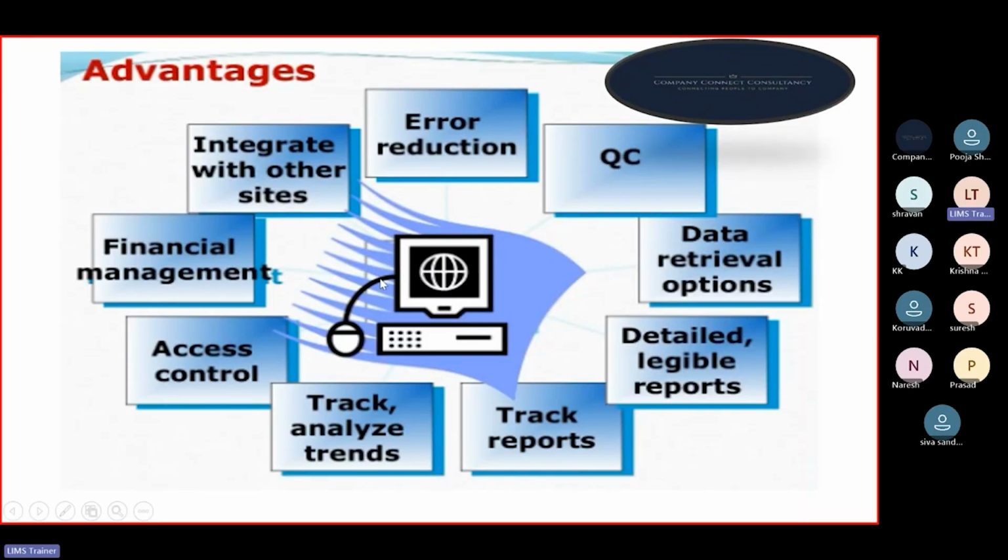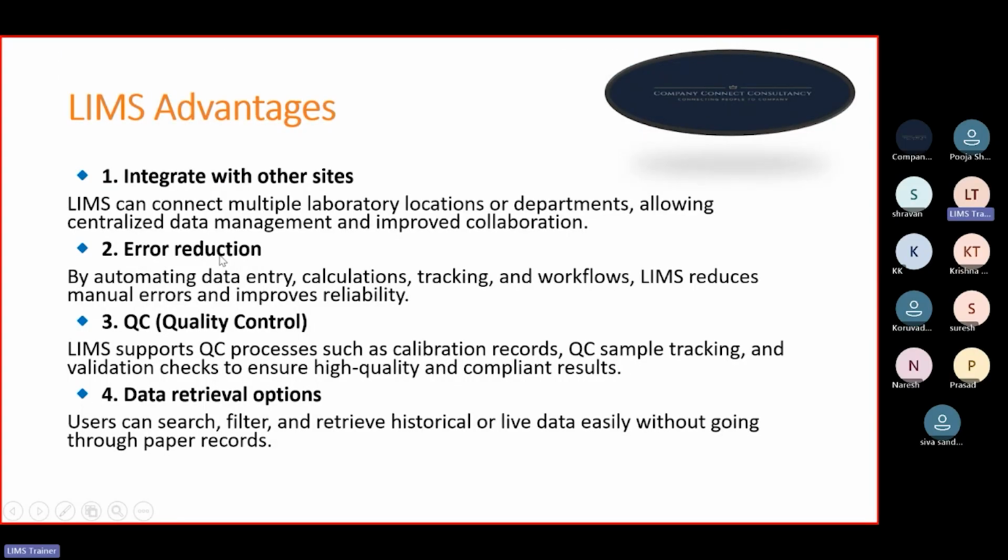Okay, so let's see some advantages of LIMS application. LIMS integrates with other sites. It provides error reduction. It provides quality control, quality checks. Data retrieval options are there. Detailed, legible reports, track and analyze trends, access control, and financial management. So let's see one by one.